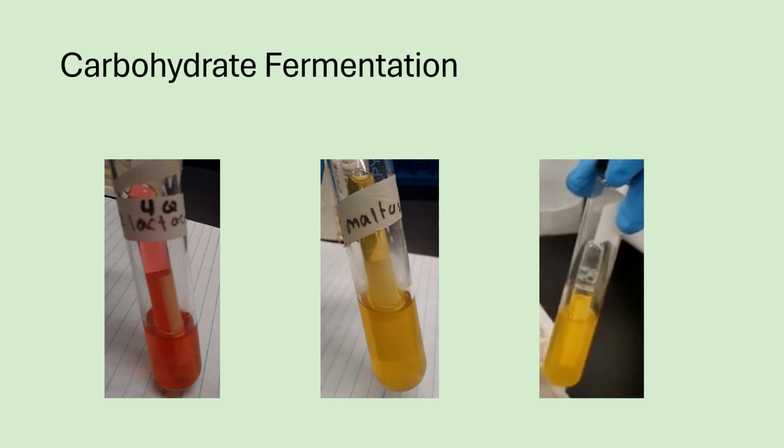So in our lab, we typically will test for lactose, maltose, glucose, and sucrose fermentation. And like I said, different bacteria will use these differently. So it's going to help you with the identification process.